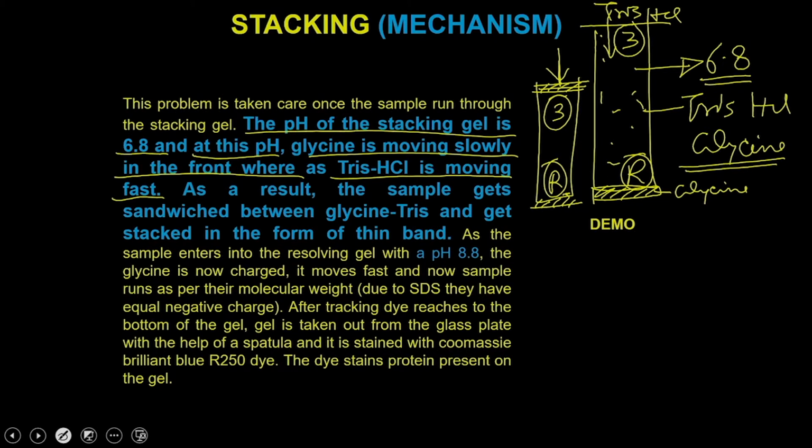This will happen because they keep running into the stacking gel for some time, and during this period the 3 and R come together and form a single band, which contains the 3 and R together, and that will happen while they are running into the stacking gel.